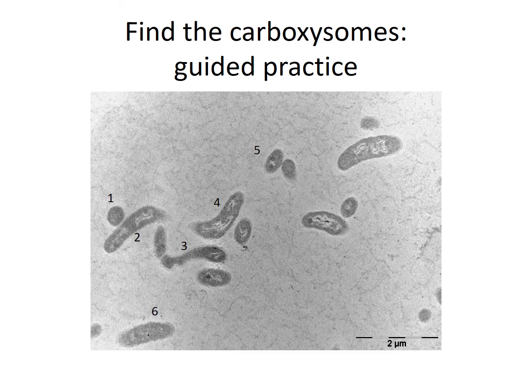So I began with the electron micrographs. I had the students all in a Zoom meeting, in a Teams meeting with me, and I screen shared with them, and I showed them a series of electron micrographs to kind of educate them on what to look for. So the first slide here shows a variety of cells that have been numbered. So I walked through the different examples with the students.